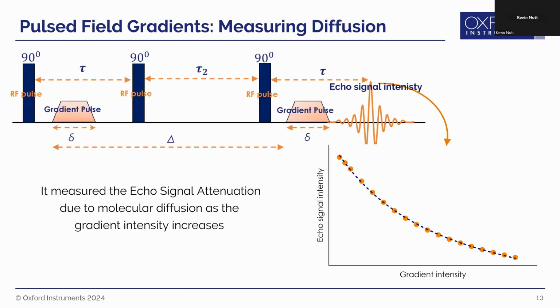Of course, diffusion is measured by using a pulse field gradient experiment and increasing the power and duration of the gradient pulses, or the time between them, which sensitizes the echo signal to the molecular diffusion. An emulsion contains both oil and water, of which you would only want to measure one. Therefore, T1 filtering is applied to remove the signal from the continuous oil phase in the case of margarine.